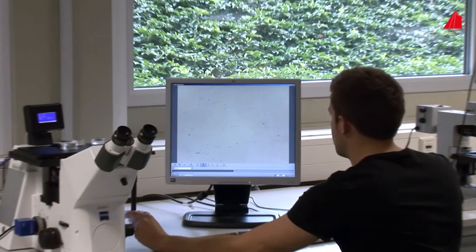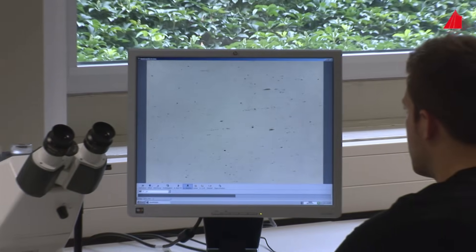Using the built-in digital camera, the polished specimen surface can be observed on the computer monitor. In the polished state, there isn't much to be seen in this material. Only some elongated non-metallic inclusions can be observed. But if these inclusions are of special interest, then the polished state is the perfect one. Inclusions may best be seen here.